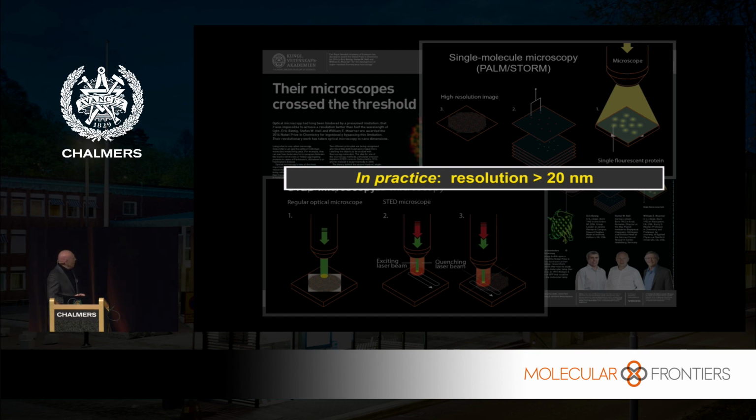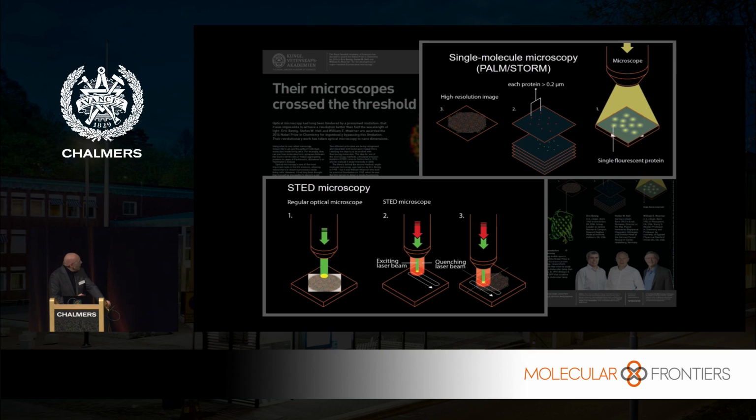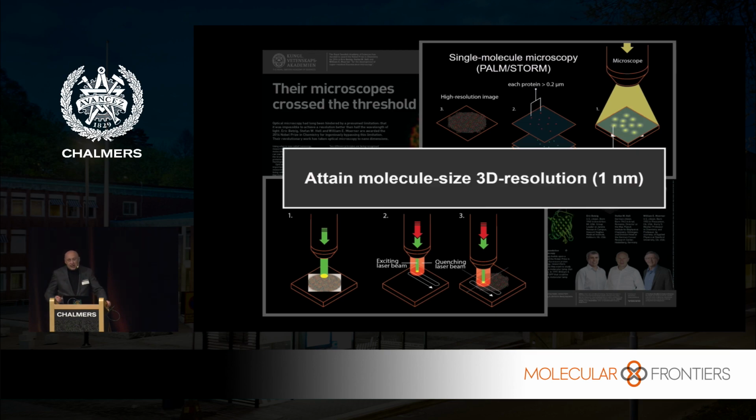So in my view, the Nobel Foundation put it just right. Their microscopes, meaning the laureates' microscopes, crossed the threshold. And what I'm adding to this, but did not attain the ultimate limit. And so the actual title of my talk and the actual motivation for the work that I'm showing now is to do just that, attain molecular size resolution with focused visible light, of course, in 3 dimensions.